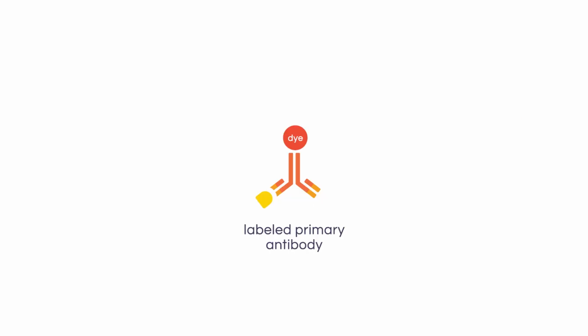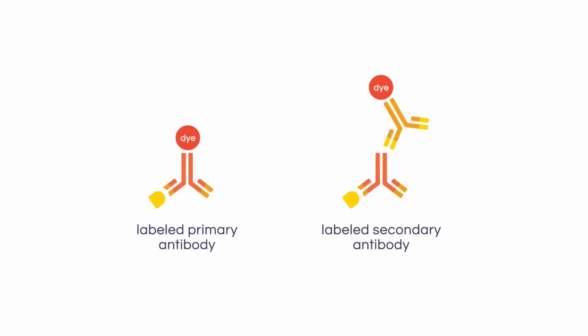As discussed in the blocking course, primary antibodies are sometimes labelled, typically either with an enzyme or a fluorophore, which allows for direct detection. But much more commonly, unlabelled primary antibodies are used instead. These can subsequently be detected using labelled secondary antibodies, and this process allows for a more universal detection, in that one type of secondary antibody can be used for detecting many different primary antibodies.